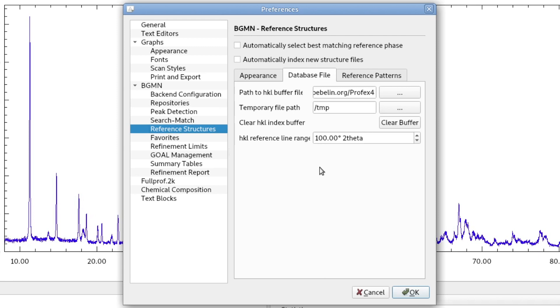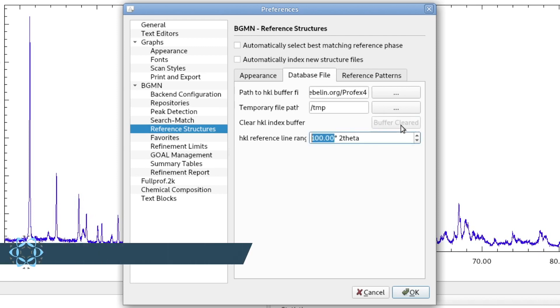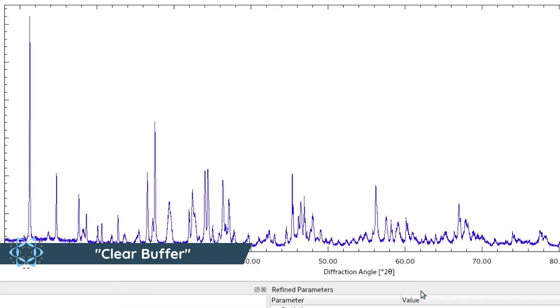If we want to re-index all the existing ones, we first have to clear the HKL buffer. Now all the HKL data is erased in the internal database. We click OK.